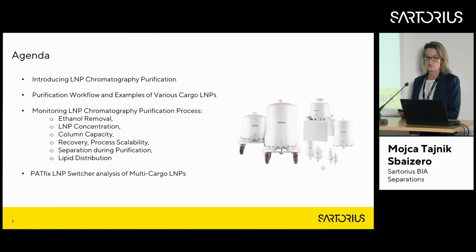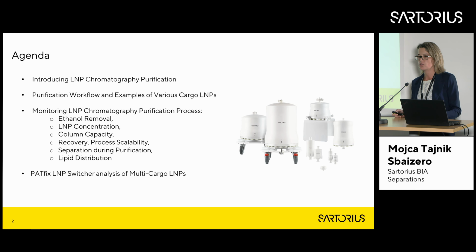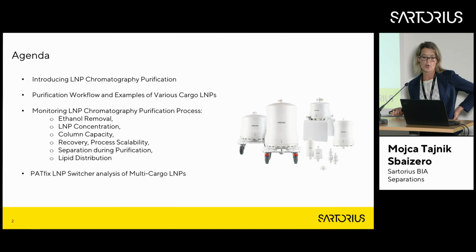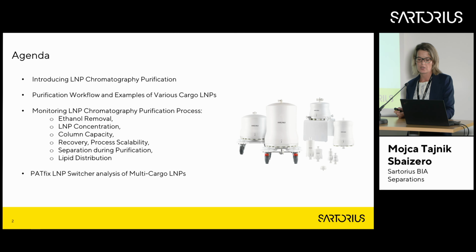So we will start with introducing the chromatography for LNPs, since this is a new field in the LNP manufacturing. Then I will show you examples of workflow, so how to do this in practice, and also, in more detail, while doing the process development, how you monitor different attributes that correspond to the efficient separation and purification, and how all this is combined with the switcher analytics that was introduced.